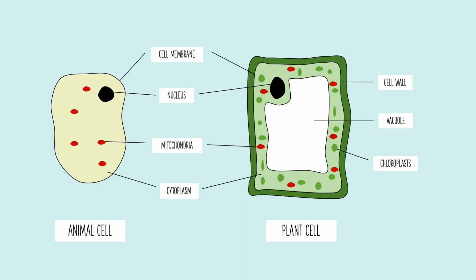Here's a reminder of our common cell types, and if you've watched my previous video on cells, you should recognise this image. We know the nucleus is the control centre of our cells, containing information in the form of DNA. Today we'll explore DNA and one particular method of analysing it.